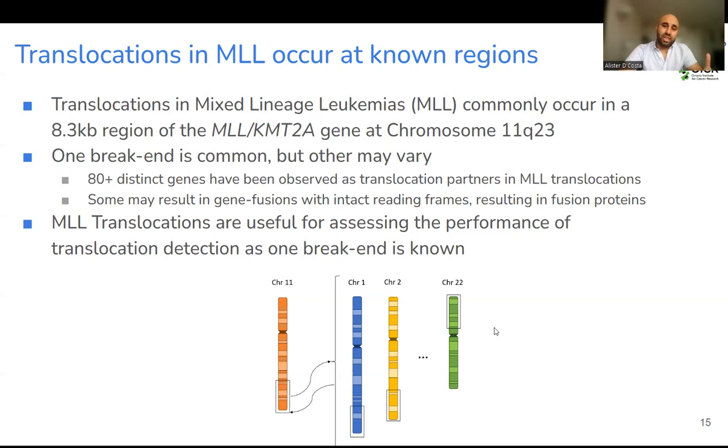So identifying the precise breakpoints of MLL translocations can be used for residual disease monitoring. And our lab has been working with Princess Margaret Hospital to get precise breakpoints that can be used to design PCR primers, hence our motivation for actually identifying translocations. I'll be using these MLL samples to compare SomVarG's detection ability to that of current reference-based approaches.